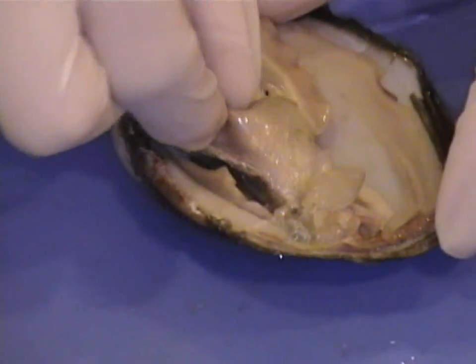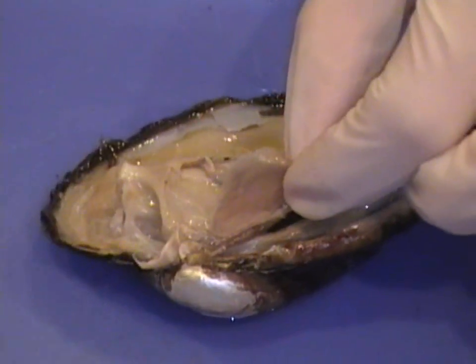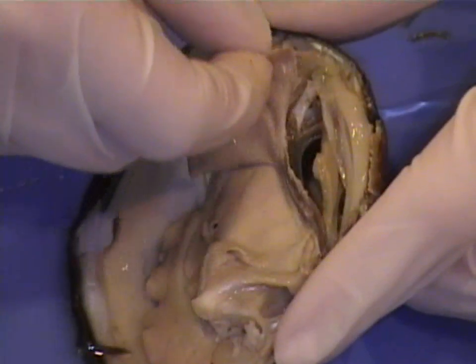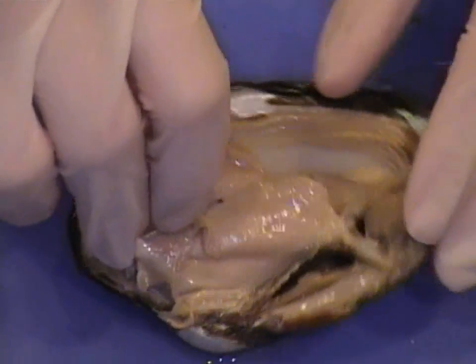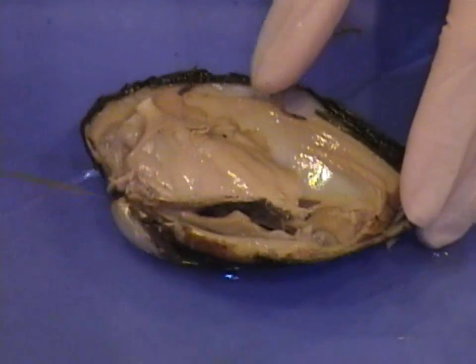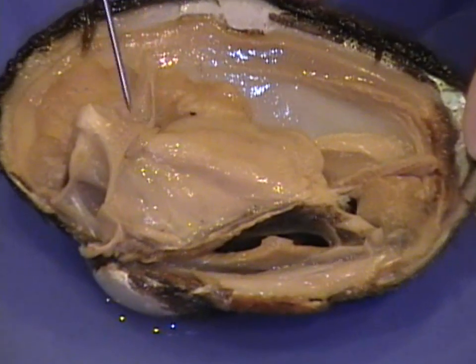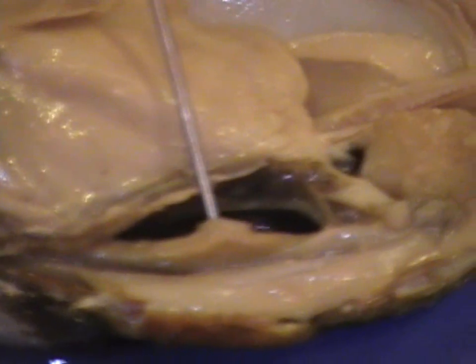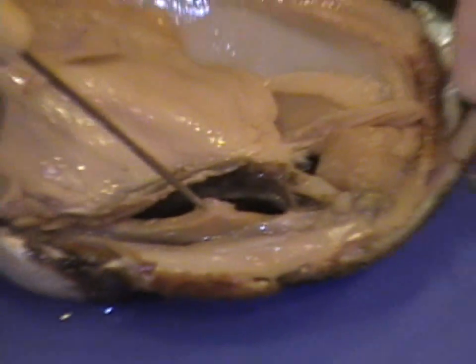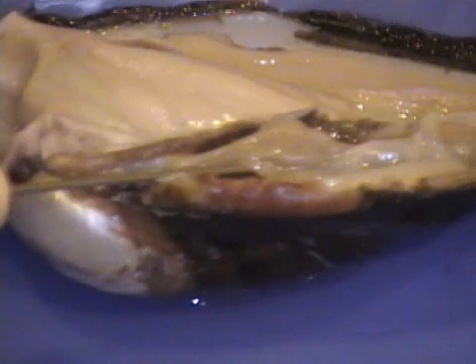Now we're going to remove both sets of gills. We're going to take a look at the inside of the visceral mass. After removing both sets of gills and removing the little layer of mantle that's covering the heart, you'll see the heart. There are two auricles — here's the right one, and underneath there's the left one.